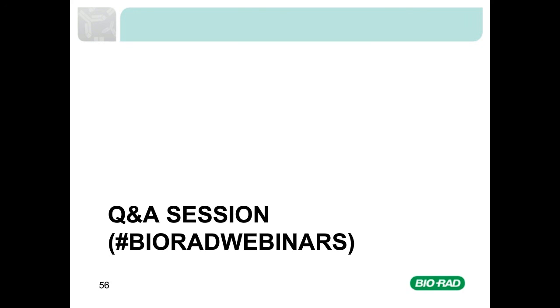If this is something you would potentially consider doing, I would again run a sample of the lysate once it's been removed after incubation with the beads coated with the antibody targeting your protein of interest, and perform a Western blot after the first IP in order to see if there's any of your protein of interest remaining in your sample.